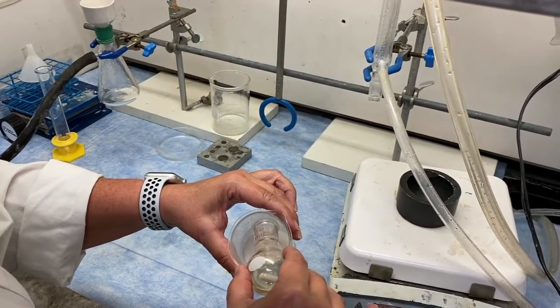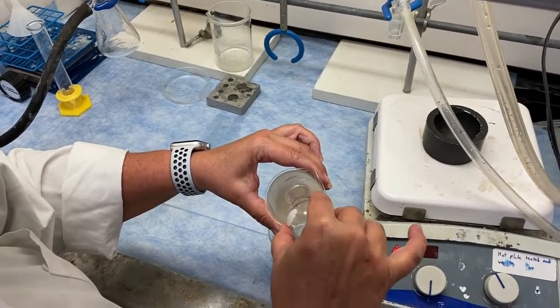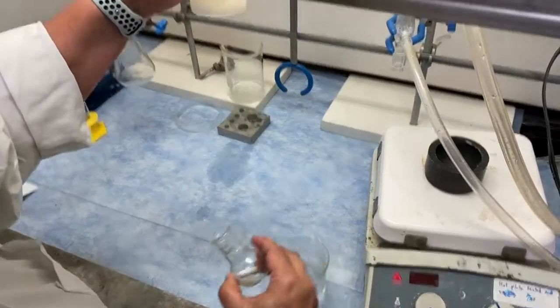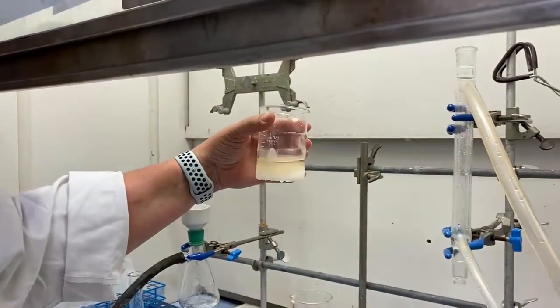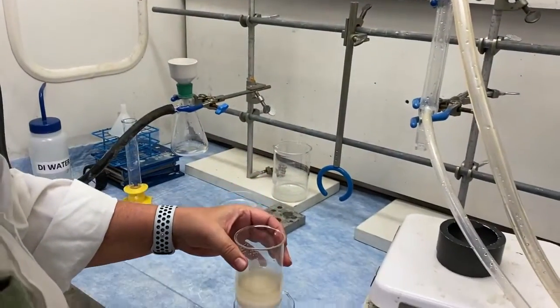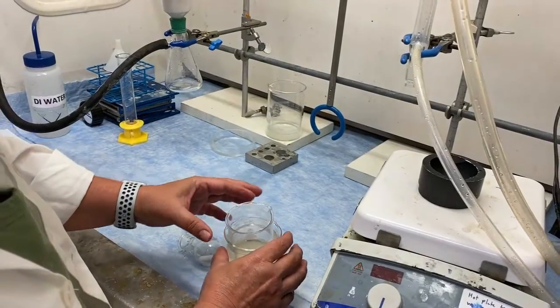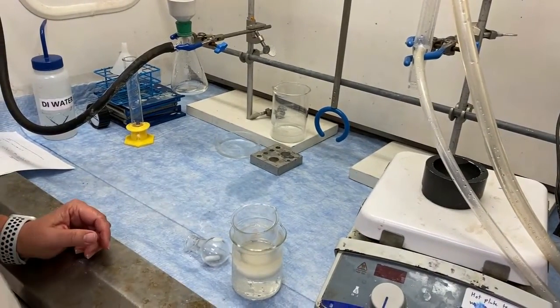Any unreacted ions are gonna stay in the water solution. Okay. Doesn't look like we have a whole lot there, but that's a pretty good yield, to be fair. Okay, I'm gonna go ahead and stick it back in this ice bath for about 10 minutes. After that, we're gonna filter it and dry it like we always do.